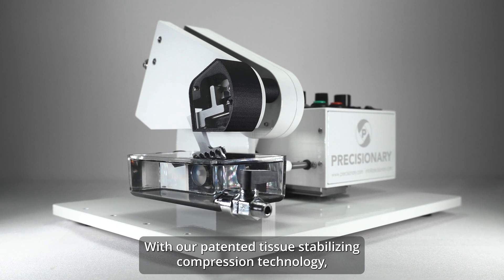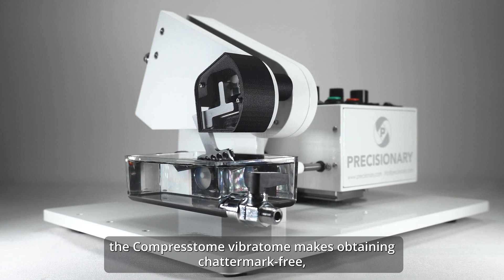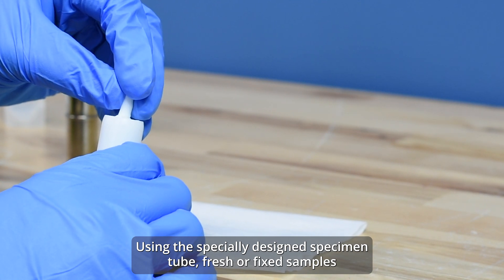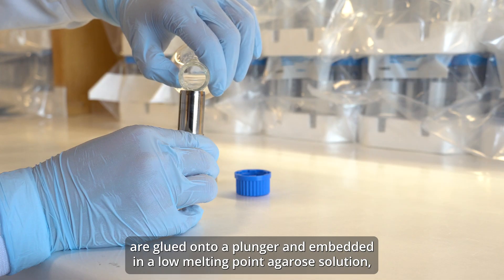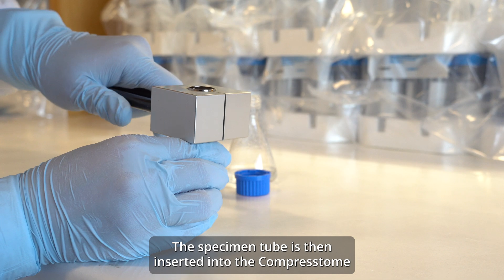With our patented tissue stabilizing compression technology, the Compresstome vibratome makes obtaining chatter-mark-free, consistent tissue sections fast and easy. Using the specially designed specimen tube, fresh or fixed samples are glued onto a plunger and embedded in a low melting point agarose solution, which is chilled in under 60 seconds using the chilling block.